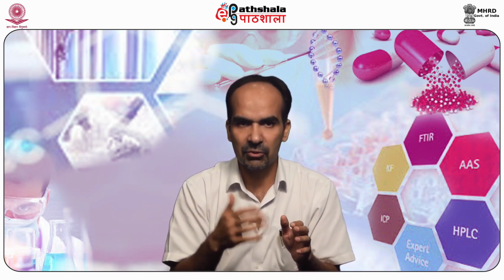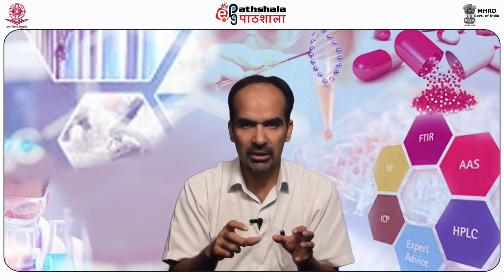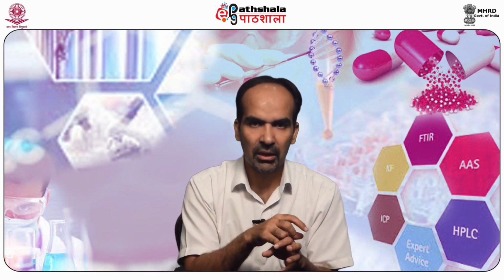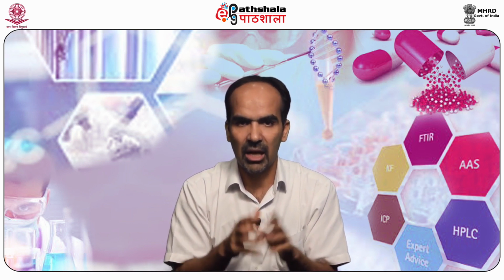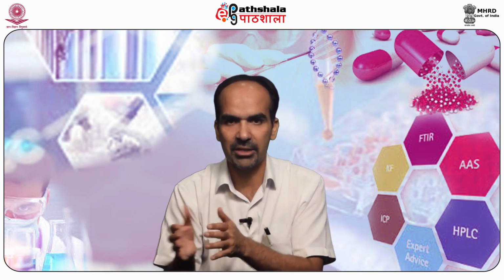The next step involves the aqueous layer. The aqueous layer is separated, made alkaline, and shaken with ether or chloroform again. The liberated alkaloids pass into the organic solvent, which is then separated and evaporated to dryness. A little alcohol is added towards the end to get rid of all volatile matter. The alkaloidal residue is finally weighed or determined by titration.